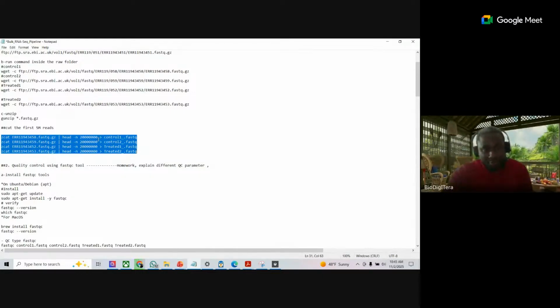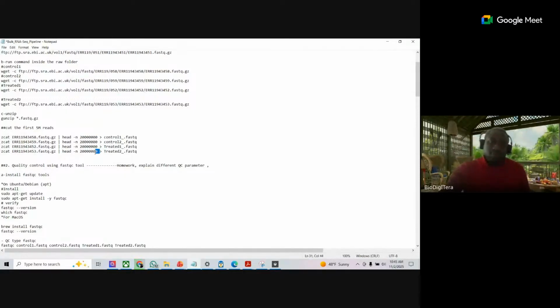You have to adapt this to your need. It's not a standard number. Okay? Okay, sir. Thank you. You must always make sure that the number you choose fits the size of your data. So don't go and say that someone told you that you should always run this. No, don't do that.